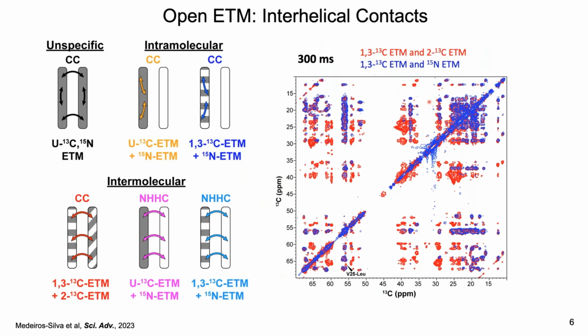Now, for this kind of structure determination of a homo-oligomeric membrane protein, the difficult stage is always how do you get the quaternary structure? How do you get the inter-helical distances as well as helix orientations? And here, isotopic labeling of various kinds is crucial. If you don't do any special isotopic labeling mixing, just have a uniformly C13 N15 labeled protein, you can measure 2D correlation spectra cross peaks, but you wouldn't be able to tell what is intramolecular and what's intermolecular. But as soon as you start to do some mixing, for example, you might have 50% of the sample with only C13 labeling, and the other 50% with N15 labeling, then your carbon-13 labeled molecules are diluted 2-fold. And so the chance of seeing an intermolecular carbon-carbon cross peak will be much lower. So most of the cross peaks should come from intramolecular origin, and that clarifies some aspects of the cross peak assignment.